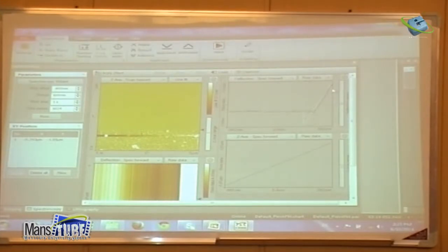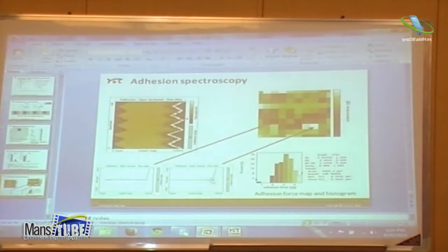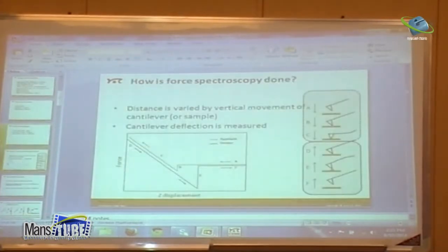So it is exactly similar to the presentation. Let's say this is the one, or if you have the model I was talking about here, it looks exactly similar to this one.